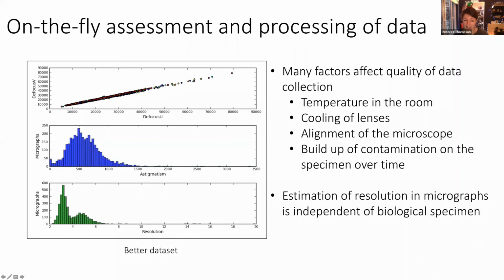And what this basically does is give you the ability to quickly look at what's going on and check that some of the parameters, for example motion, are within the expected range. And it gives you an opportunity to say, hey, is there something going on here that we need to go and take a look at?